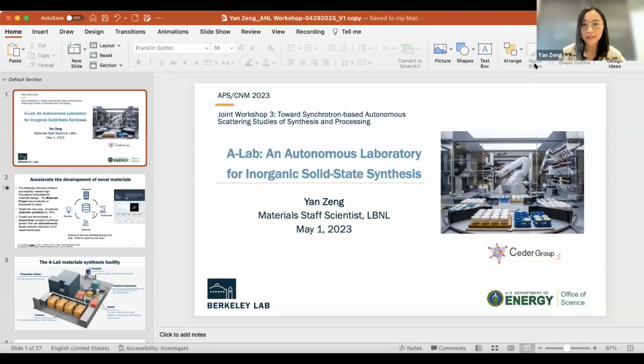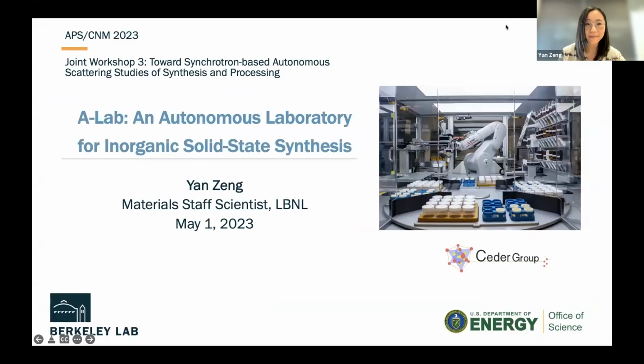Thanks. Thank you for the introduction, and thank you for the invitation. Let me share my slides. All right, can you see my slides? Yes. All right. Hello, everyone. Good afternoon. Thank you for the introduction again. My name is Yan. I'm a staff scientist at Lawrence Berkeley National Lab, and today I would like to share with you our very recently up-and-running A-Lab. It's an autonomous laboratory for inorganic solid-state synthesis. I will be sharing some photos, videos, as well as our machine learning for XRD work that might be more relevant to this workshop.